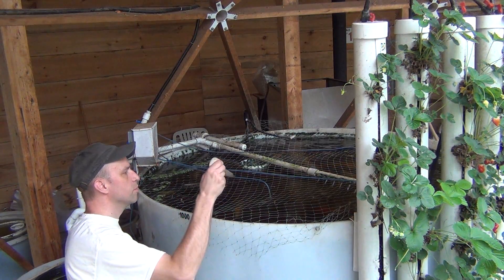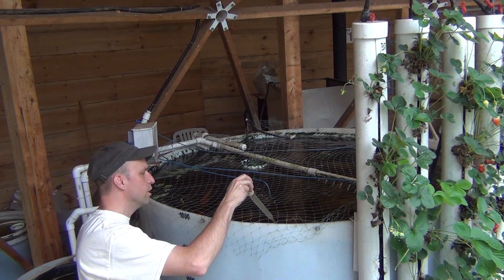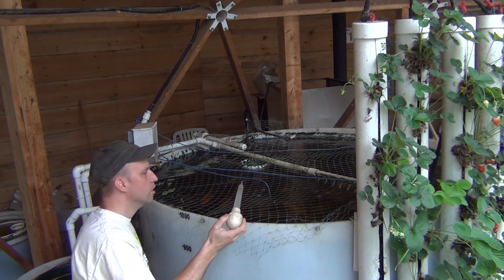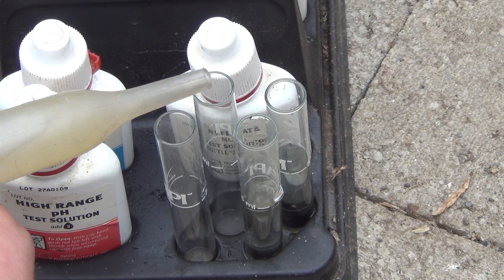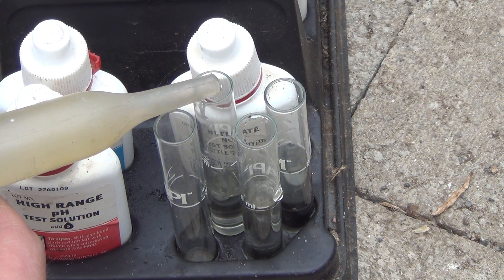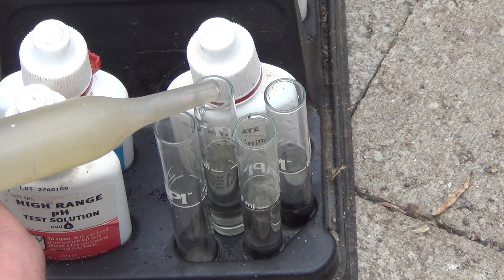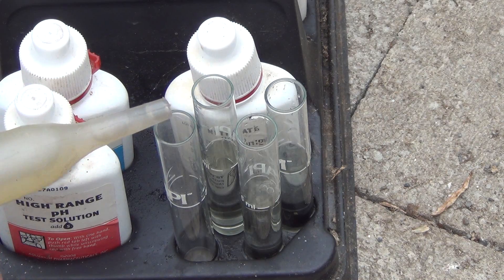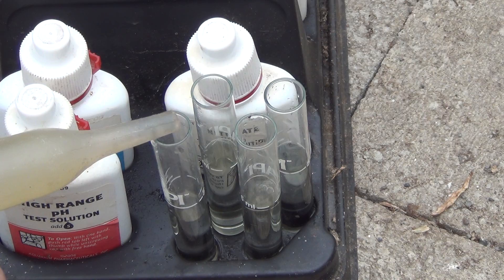I'll try to be as accurate as possible, using a turkey baster to extract the water sample and drip it into each test tube. It's ironic — back in the day when we took chemistry and did tests like this, we never really cared to be that accurate and didn't understand the importance of it. Now today we do these tests and try to be right on the money with the measurements.